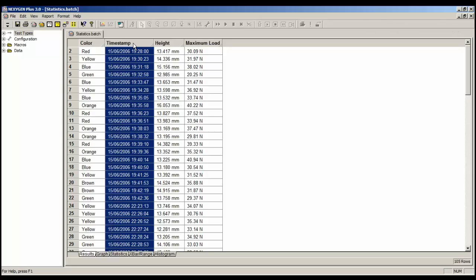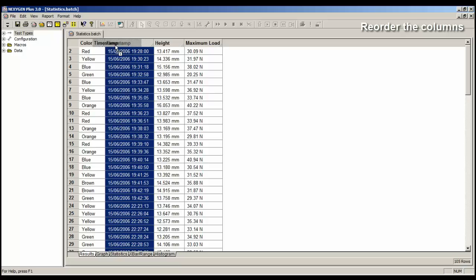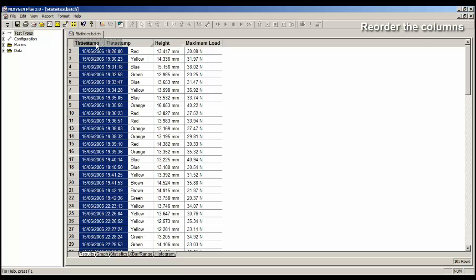The second thing is that the columns can be reordered. So if I want to move the timestamp column to the left, click on the header, and slide it, and then release the mouse button, and the columns have now reordered.